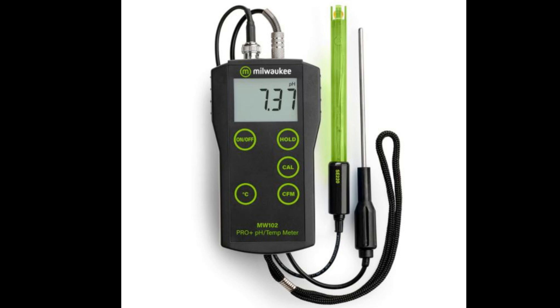This meter gives you the control to fine-tune your water chemistry and hit that flavor profile. It's not just for pros in a lab — it's for serious homebrewers too. And speaking of serious, they call the included probe the SC220 and say it's lab grade, which means it can handle the wear and tear of a professional setting: constant use, messy samples — built to last and give reliable results.